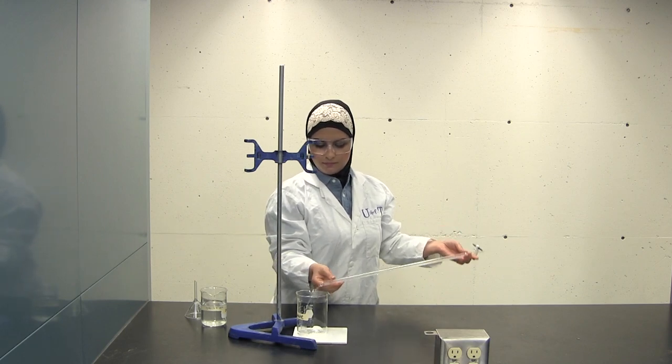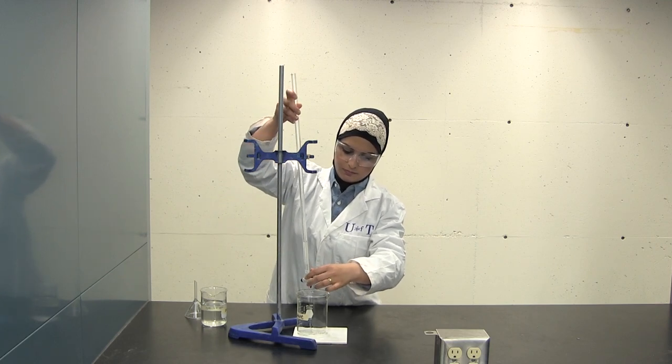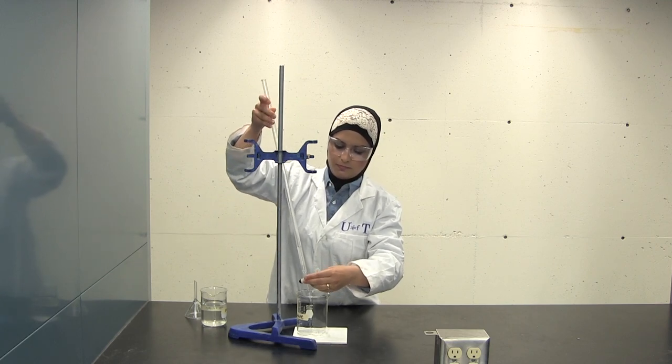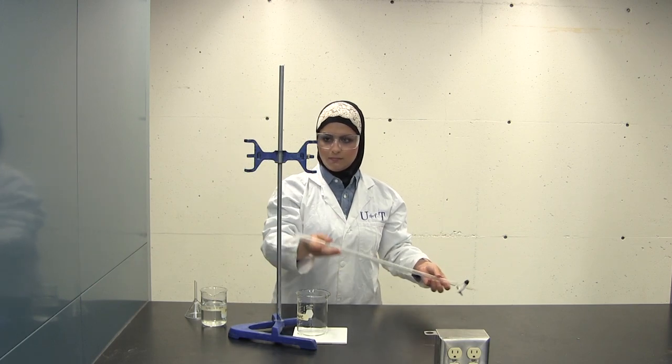Repeat this process twice with distilled water and then three times with about 5ml of your titrant. The titrant is the reagent of known concentration which is dispensed from the burette during titration.